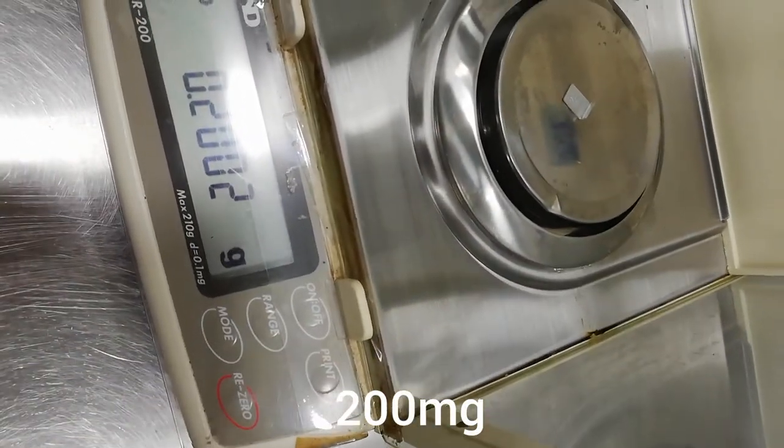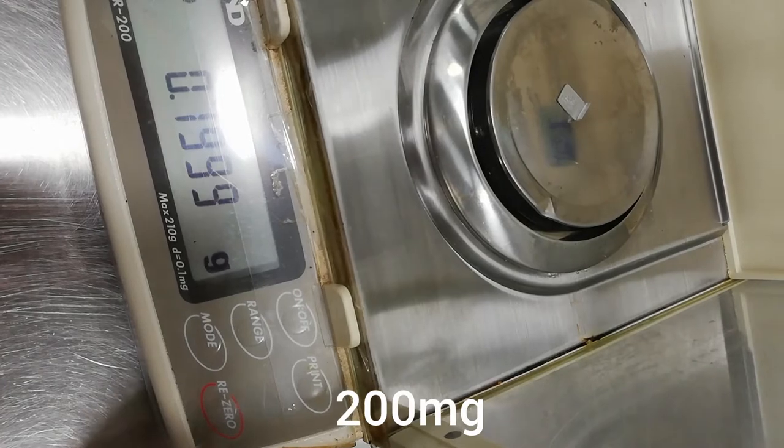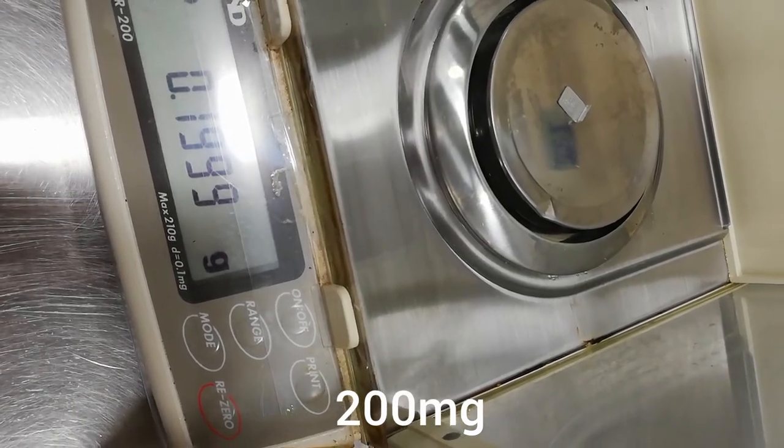For 200 milligrams I do the same — I observe the result and write it down on the sheet in the column for 200 milligrams.